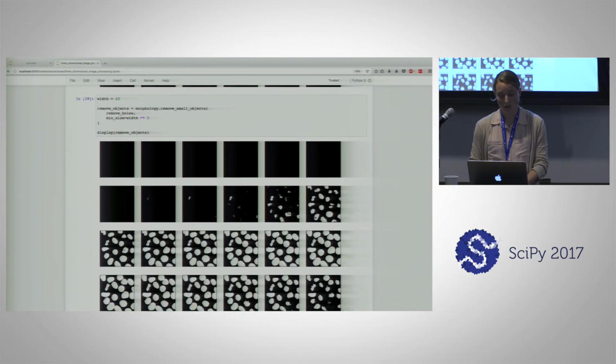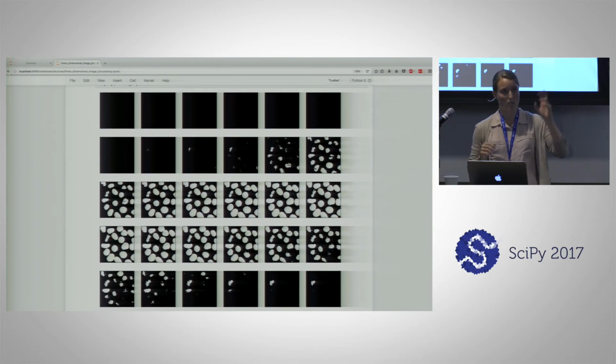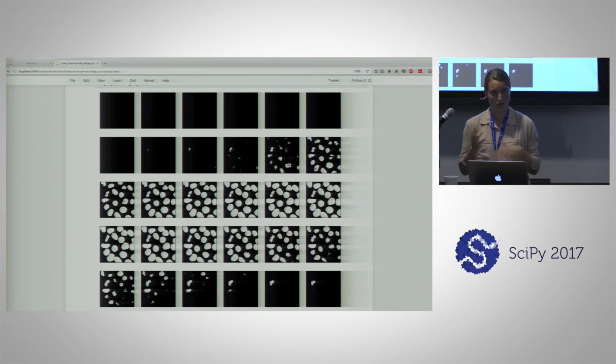Likewise, with remove small objects, in those top and bottom planes, we've now removed those little speckles that were falsely detected foreground pixels that belong to that murky region at the top and bottom. When you start to see the cells appear or disappear, we do get speckles, and the reason is the same as why those holes at the top and bottoms of the nuclei didn't disappear. Same with those speckles, because they are connected to larger regions in the planes above or below them.